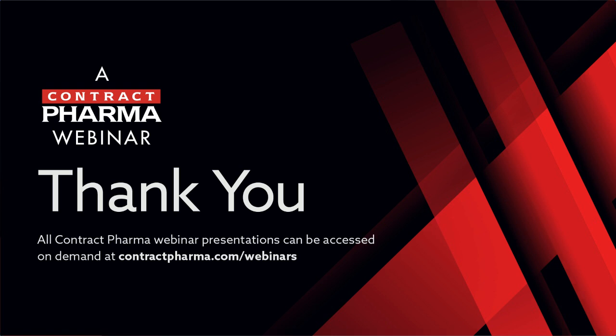That's going to depend on your cap. It's going to depend on your crimp. It's going to depend on your septum and your bottle, your vial, and that's usually figured out during your process validation. So you would want to play around in your design phase with different settings. You probably get some settings from the manufacturer. You want to play around with settings to try and optimize that.